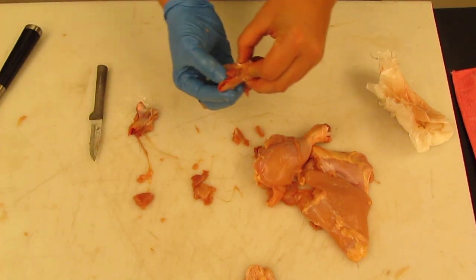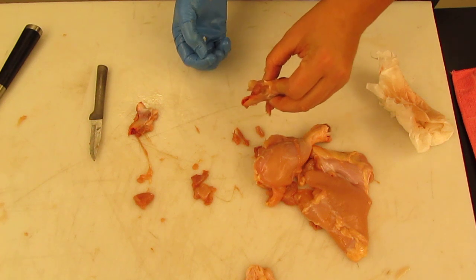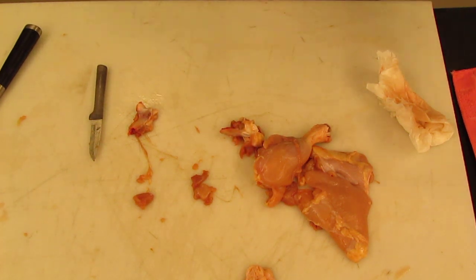Break the bone and take a look at the bone marrow inside. Okay, are there any questions?